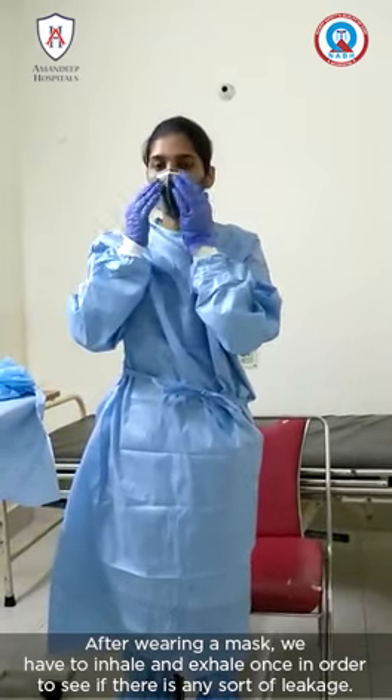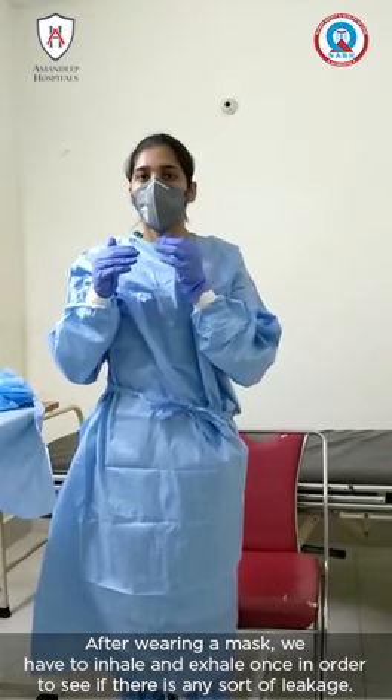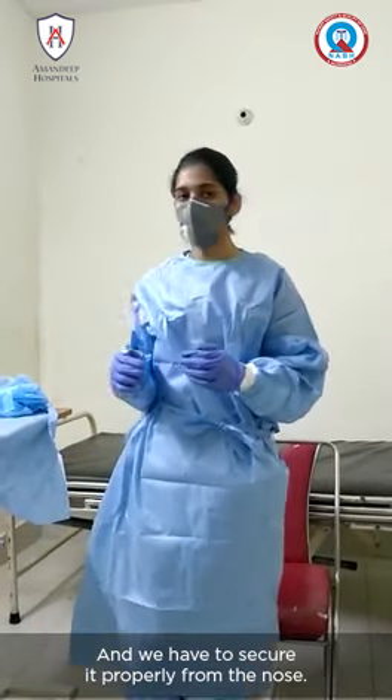After wearing the mask, we have to inhale once and exhale in order to see if there is any sort of leakage, and we have to secure it properly from the nose.